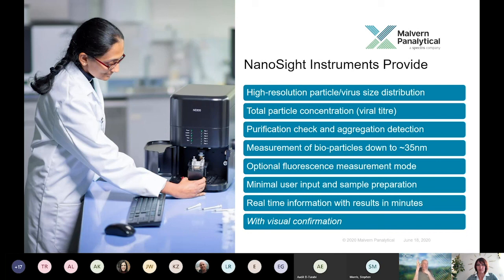And that increases the resolution capability of the technique. So what would be interesting in the example that you just mentioned, if on a Zetasizer Nano you're getting a fairly broad monomodal peak, if you did the same measurement using MADLS, it may well be that you resolve other modes because of that extra information. So, thanks a lot, Mike.